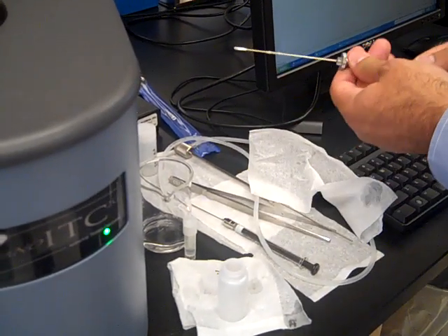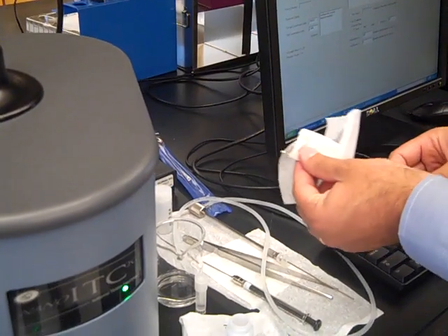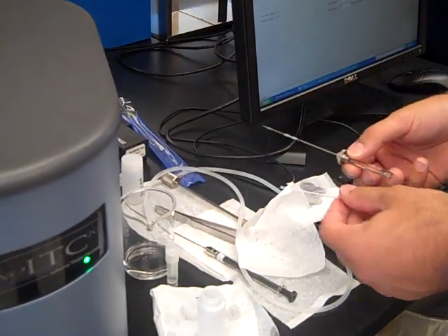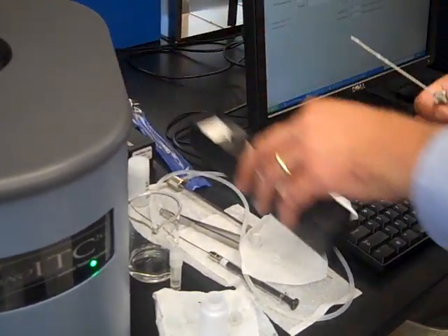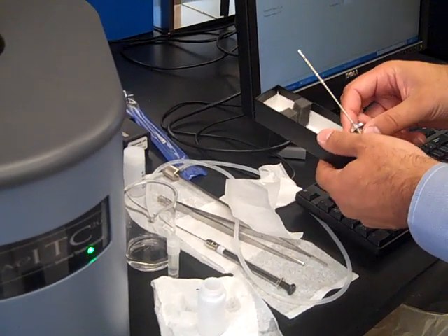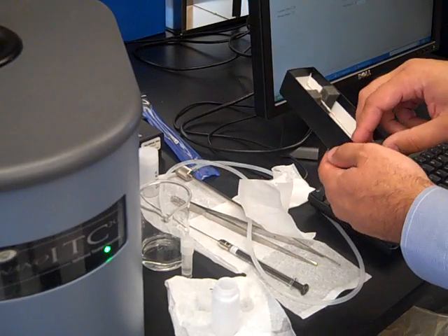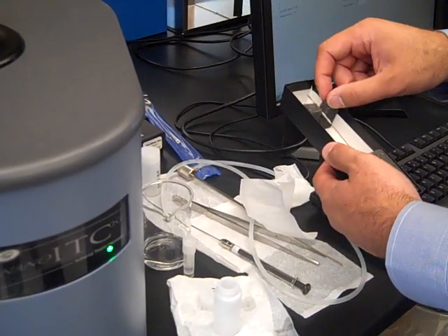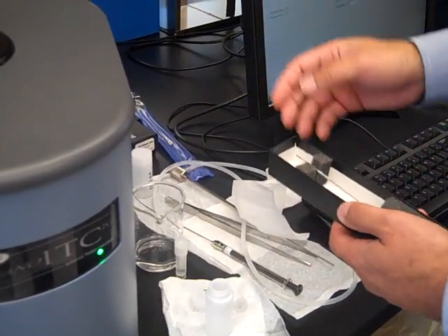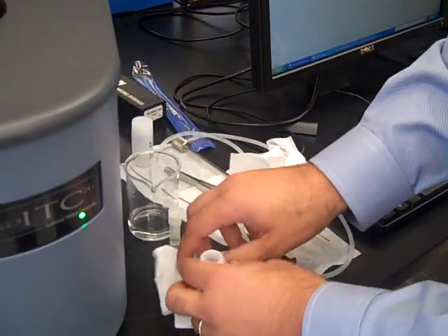And then, you know, you can either start a new experiment, or if you're done for the day, you can leave the syringe out to dry. But you might want to just let it dry in its case here so that it won't slide or roll off anywhere. And you just leave the plunger out and just secure the syringe in place. And you don't necessarily want it resting on here. You kind of just want it to be able to move free so it's not going to get bent by accident. And then we can just store that back there.